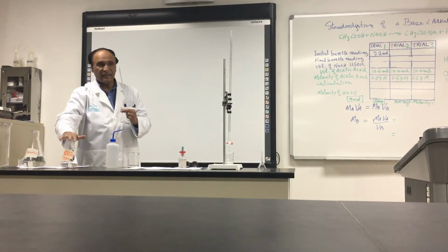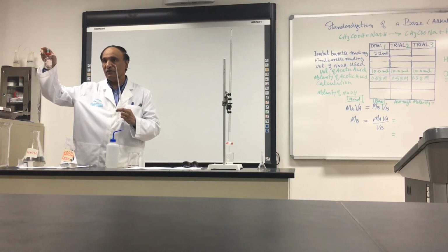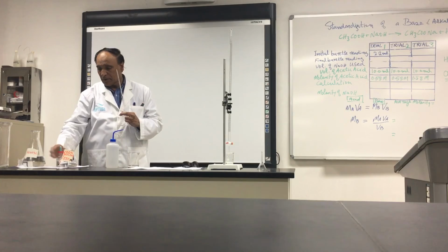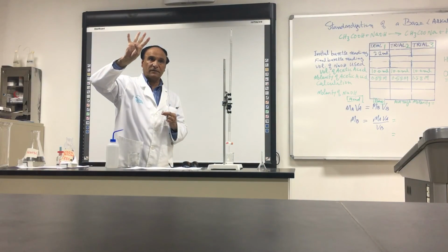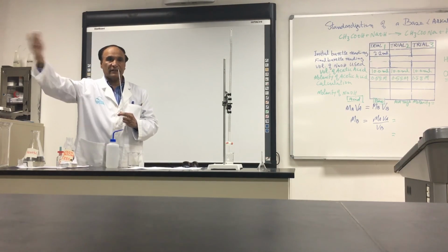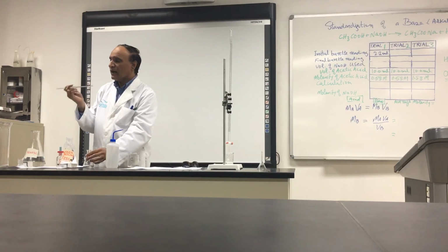I will put the vinegar and the indicator, this is the indicator, phenolphthalein, which tells us the end point. I will show you now. I will put these two things in 4 places: here, there, that place and that place. Wherever there is less crowd, you go there. The second student will go there and he will take this one. This is already washed with the water.